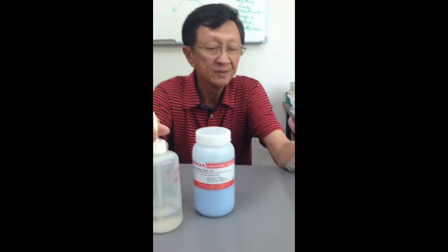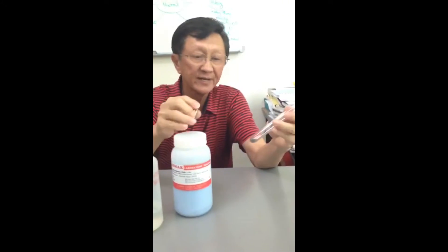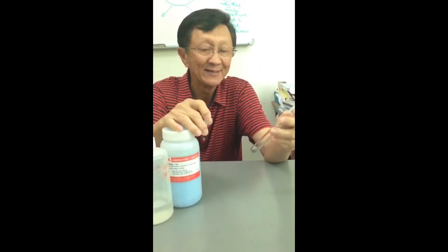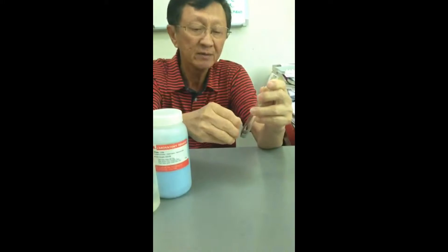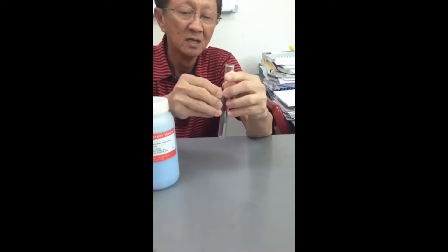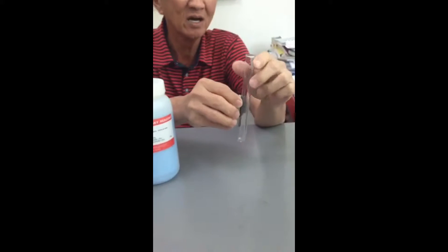Now what I have here is iron filings. And iron filings are magnetic right now. Can you see? Iron filings are magnetic right now.